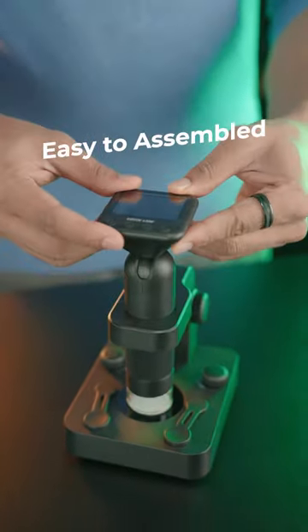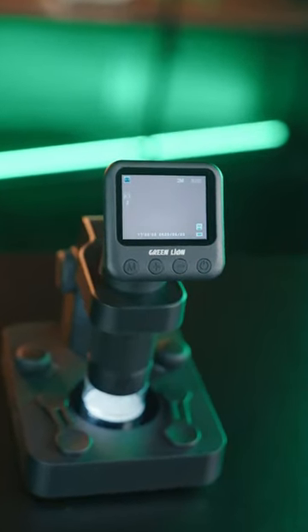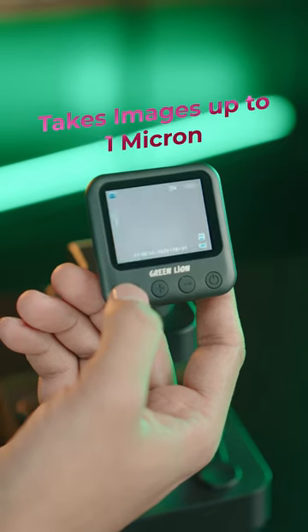This microscope is easily assembled and ready to use. It utilizes the best possible lenses, and it allows you to take images up to 1 micron.